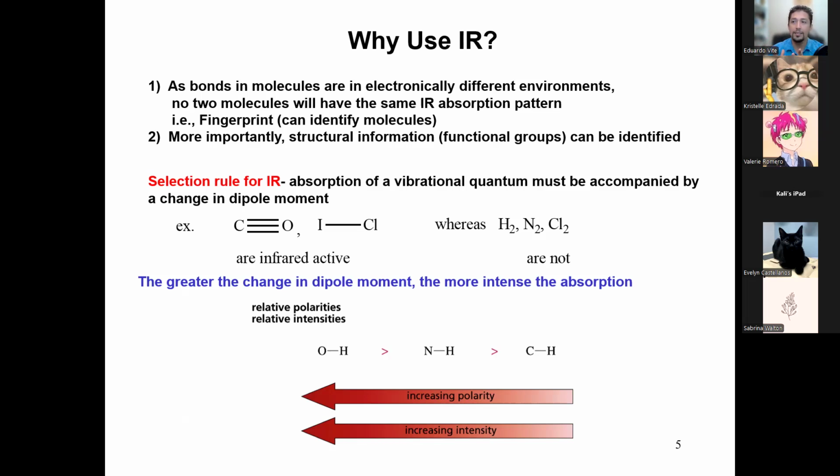Does that make sense? All molecules have their own unique spectrum, and you can look at that spectrum to help you identify the molecules. It's just another way that we do it. And again, functional groups only. You cannot look at a spectrum and tell me this is C6H5O2. I don't know. Could be. It could also be a huge formula and still have one OH, and we're only going to see the signal for that one OH, right?